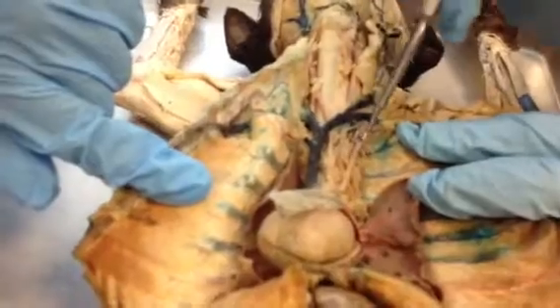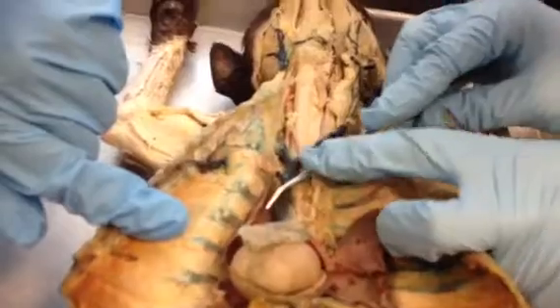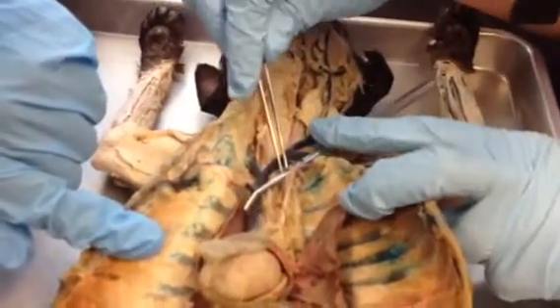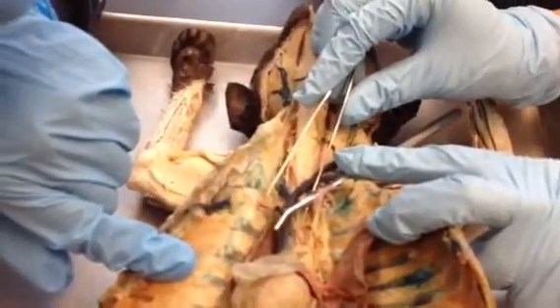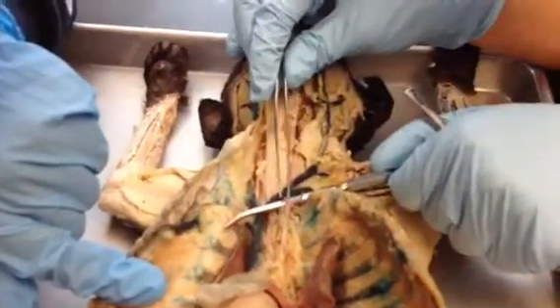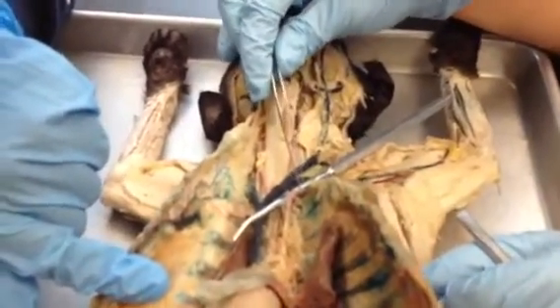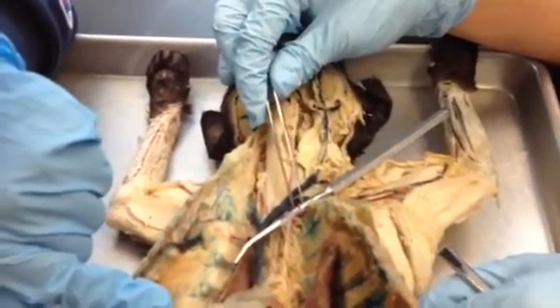On your lab practical, all three will be exposed just like this, and you just need to know the order in which they go in. So the first branch is right here, and this branch is called the vertebral artery. The second branch is right next to it, and this is called the costocervical artery. Then the third branch is here, and this is called the thyrocervical artery. You guys good so far?